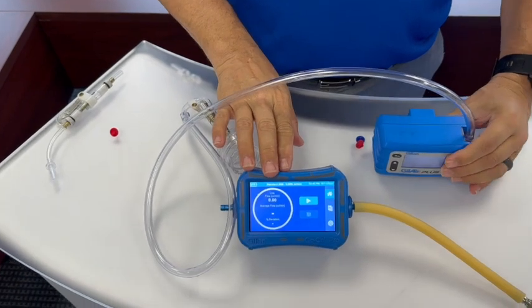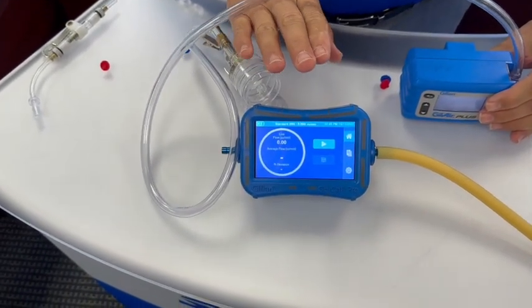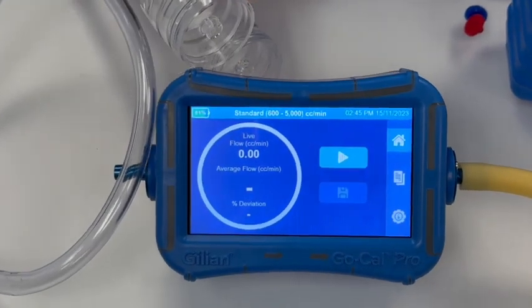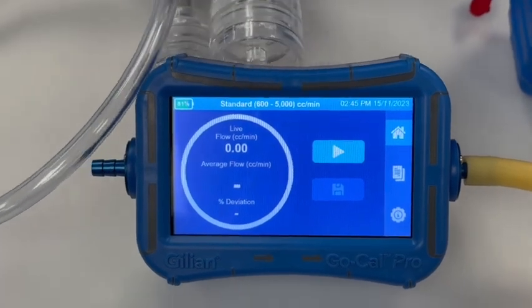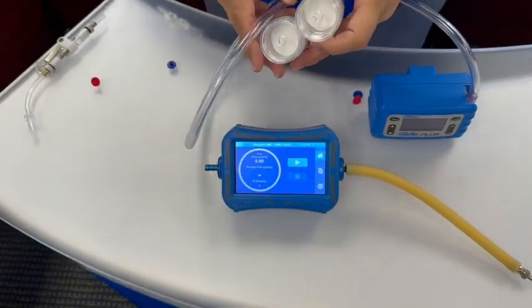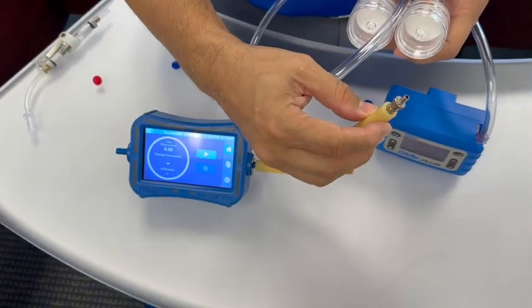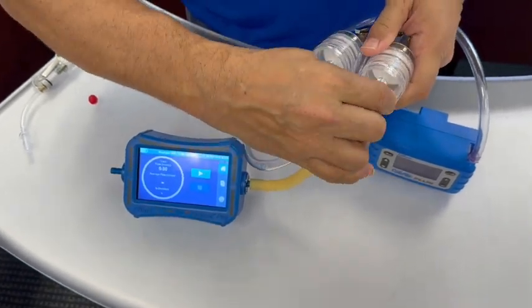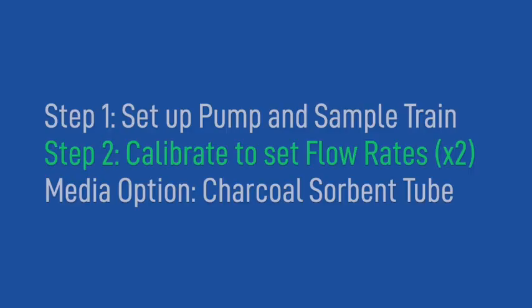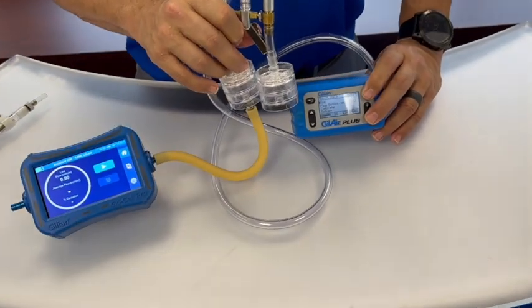Here we have the Gillian Go-Cal Pro calibrator. Make sure you're using the correct flow range for the sampling that you're going to be setting your flow rate for. We're going to be calibrating each one of the media independently of the other, so we'll need to connect the tubing from the Go-Cal Pro to the inlet side of our filter cassette media.